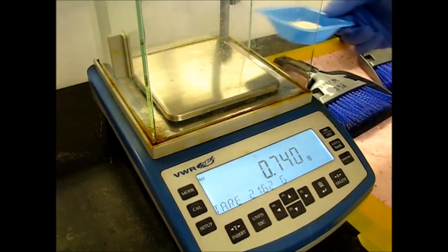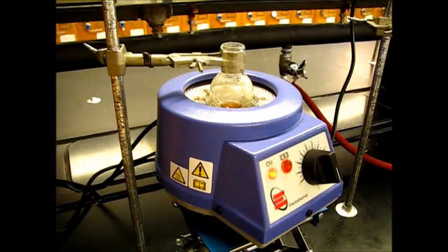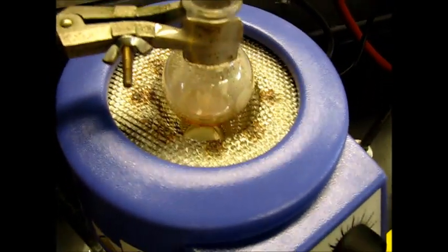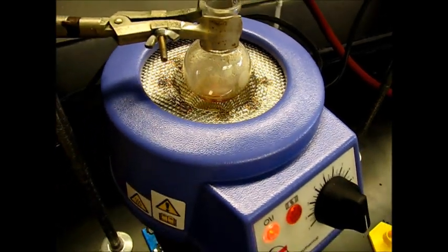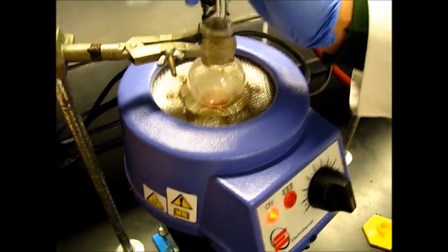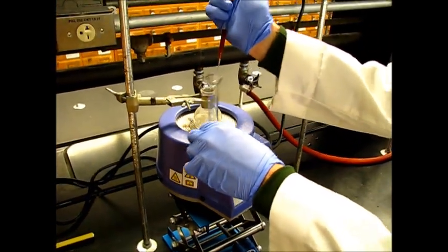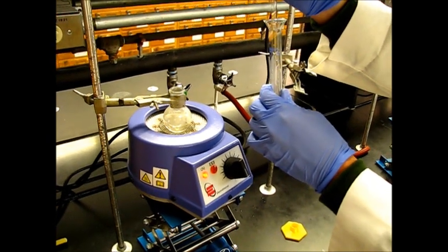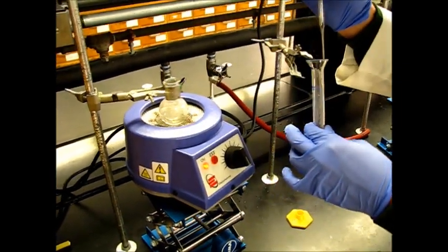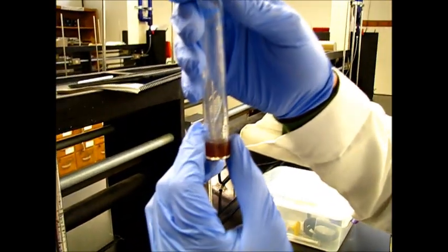We weigh this with paper and then subtract the paper weight. Our distillation is done — we have removed the distillation assembly. You can see a brown oil residue remains. Let's see what volume we got.